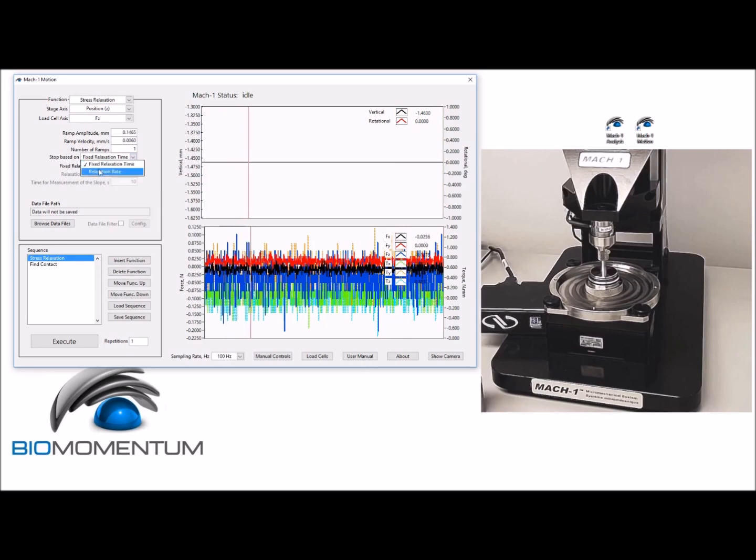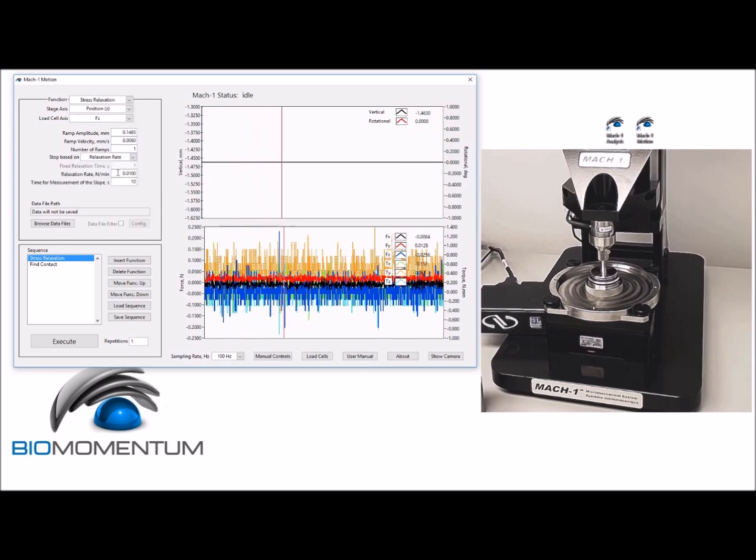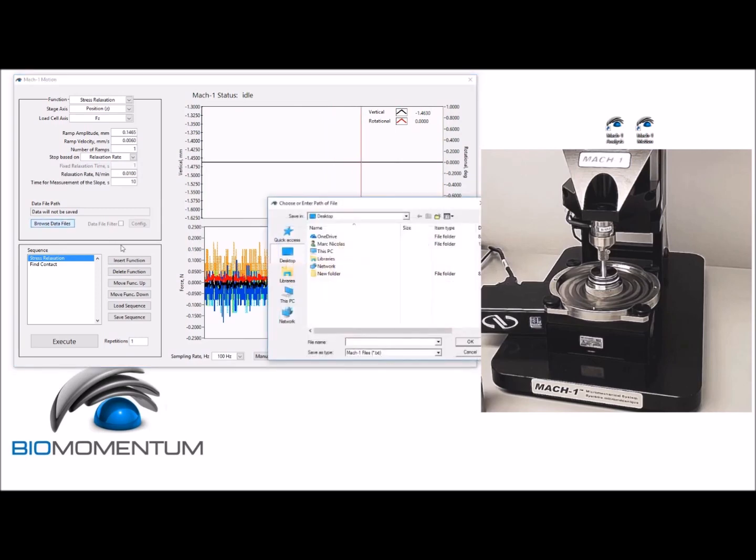Of 0.01 Newton per minute with a time for measurement of the slope of 10 seconds. We will save the data in a file with the following file name: group number underscore team number underscore torsion underscore rubber.